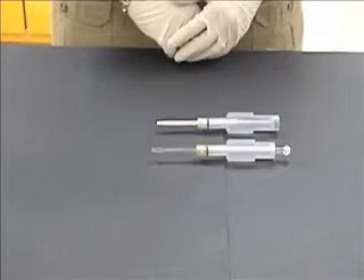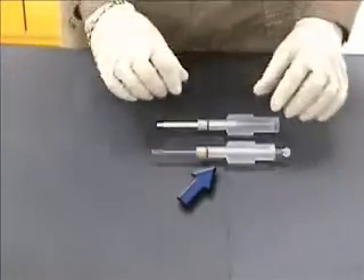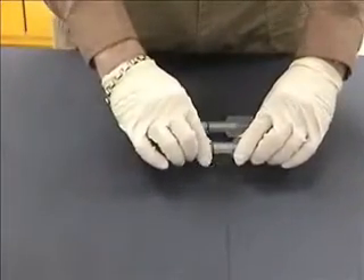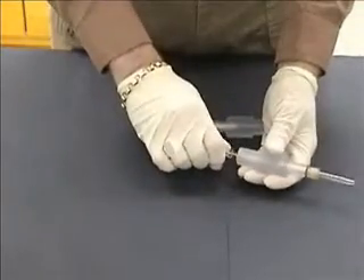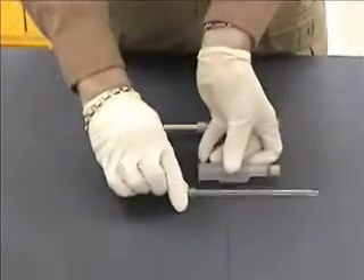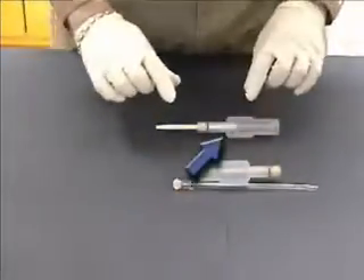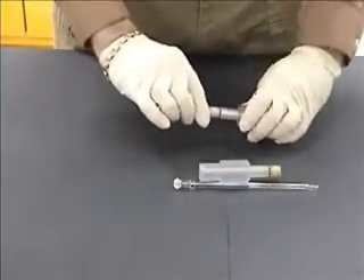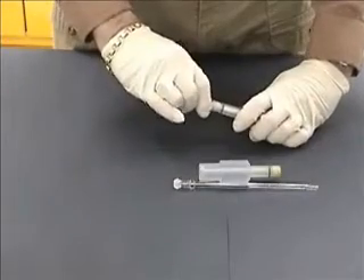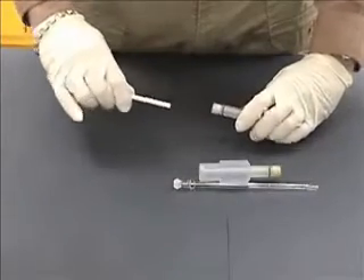There are two types of injectors in torch adapters. For the ball joint type injector, loosen the injector nut counter-clockwise approximately one quarter turn and remove the injector from the center of the torch adapter. For the alumina ceramic type injector, loosen the injector nut counter-clockwise a quarter turn and remove the injector from the injector end of the adapter.